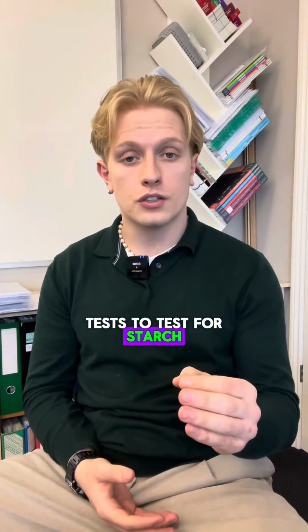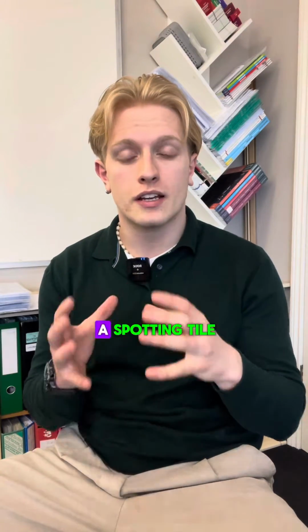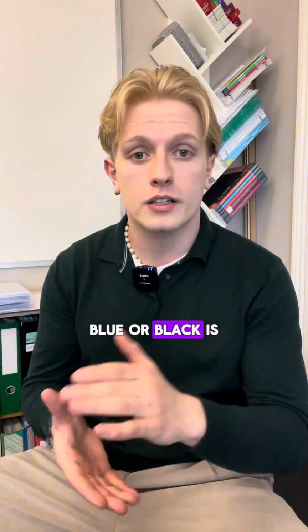To test for starch, you use iodine, which is an orange chemical. You drop it onto your food substance in a spotting tile. If starch is present, the iodine, which is orange, turns from orange to a blue or black. Blue or black is always on the mark scheme.